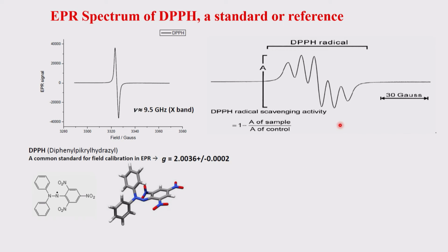So you can get the isotropic spectrum for this, and when you have an anisotropic environment, you can get all of these as well, and their couplings, etc. This electron can be here, this electron can be here, and all of these. Therefore you can get the corresponding 5 lines, 1, 2, 3, 4, 5 lines. How do you get 5 lines? There are 2 nitrogens.